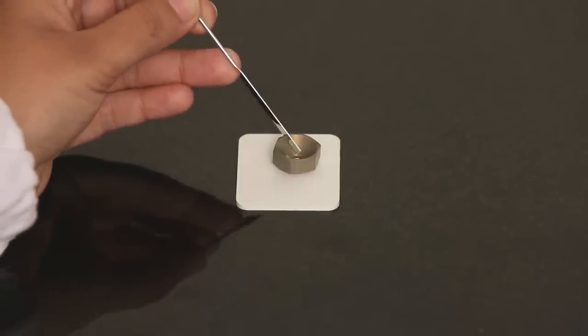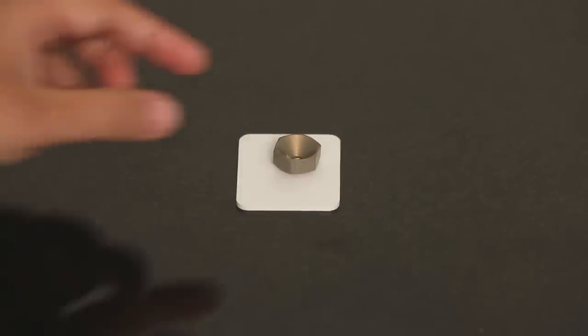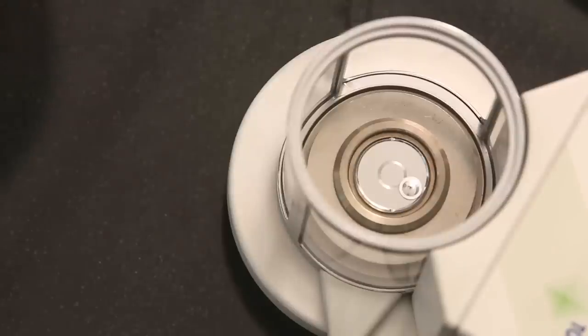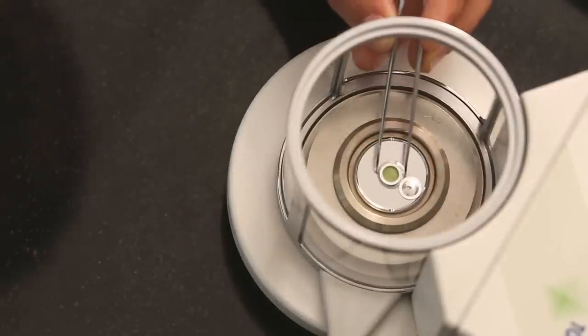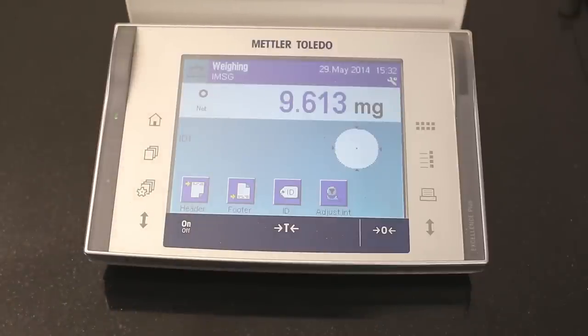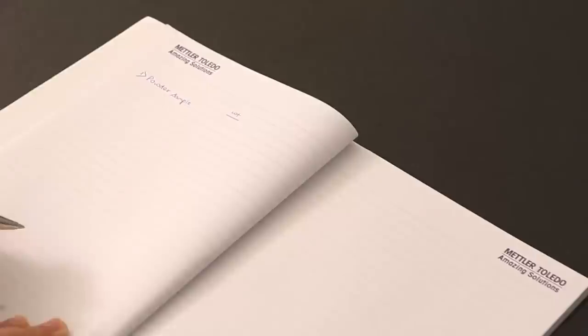The funnel makes sure that no sample is spilt on the rim of the crucible. Remove the funnel. Close the weighing compartment and let the balance stabilize. Read the weight displayed on the balance terminal and note it down in your laboratory journal.